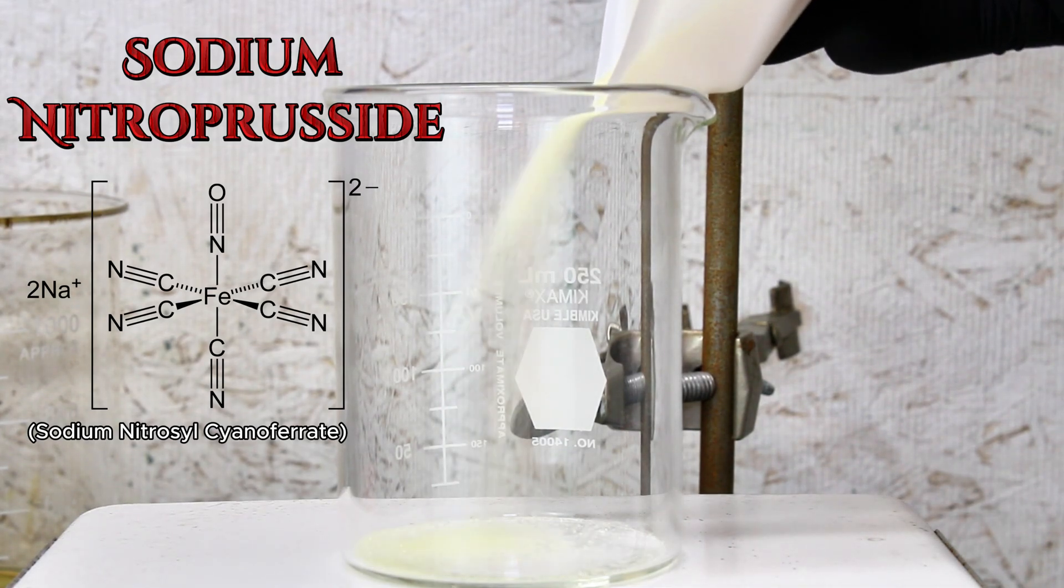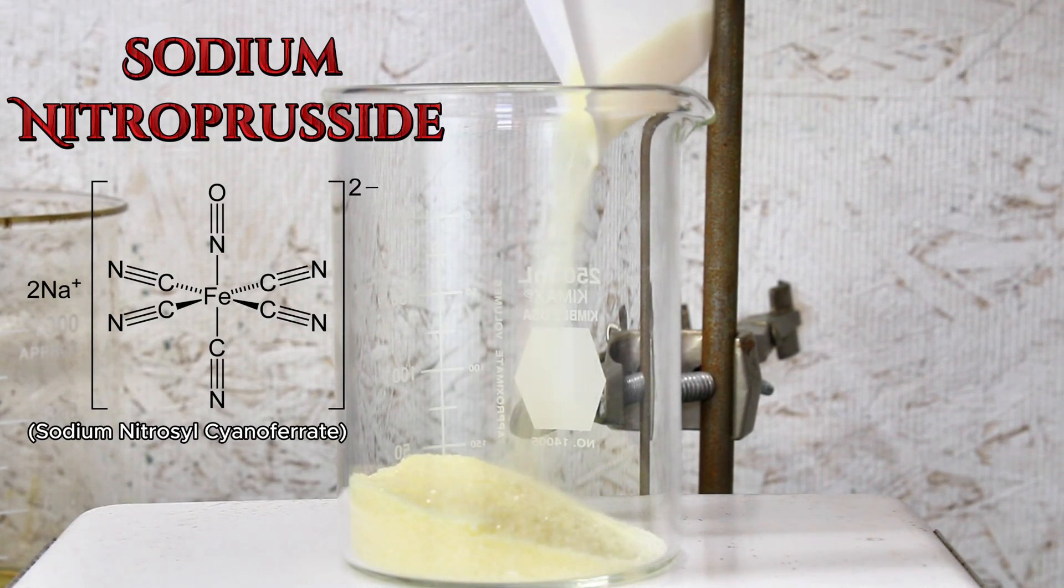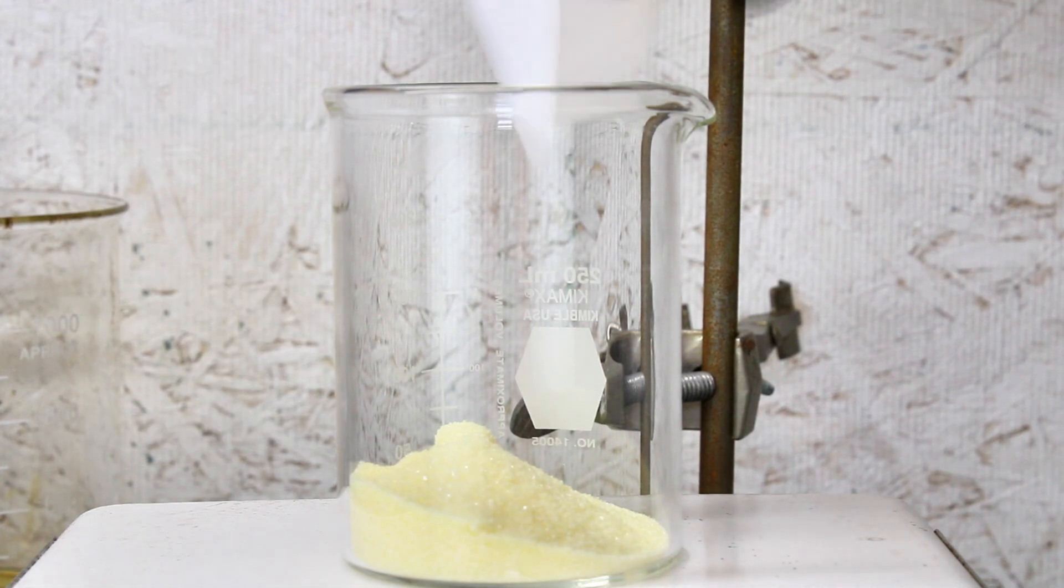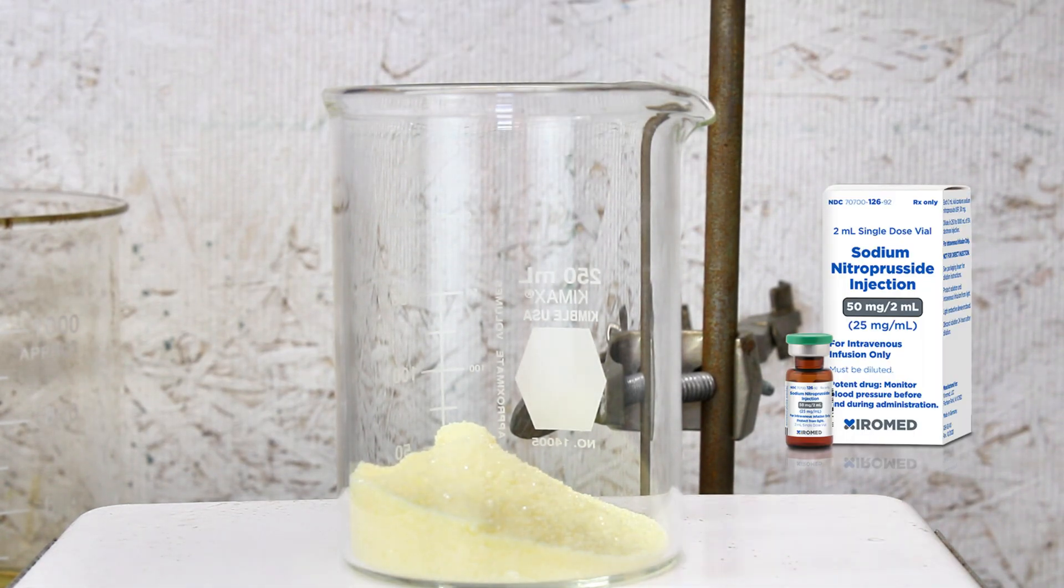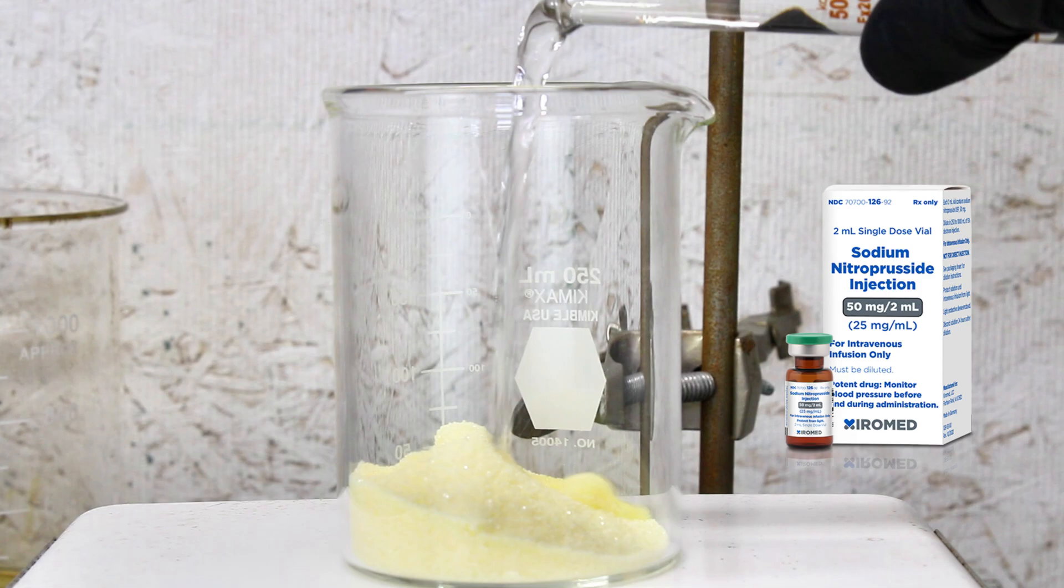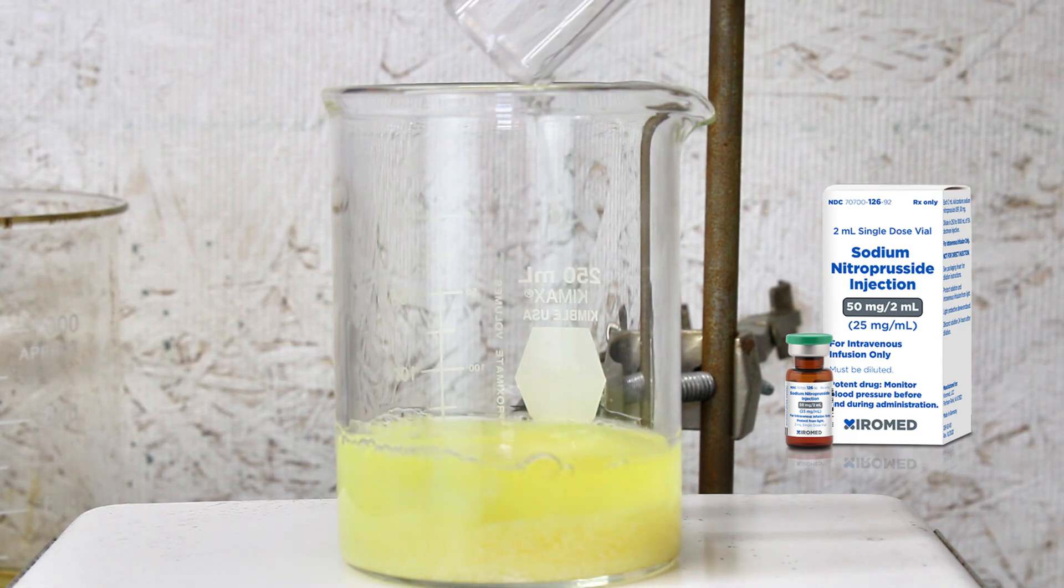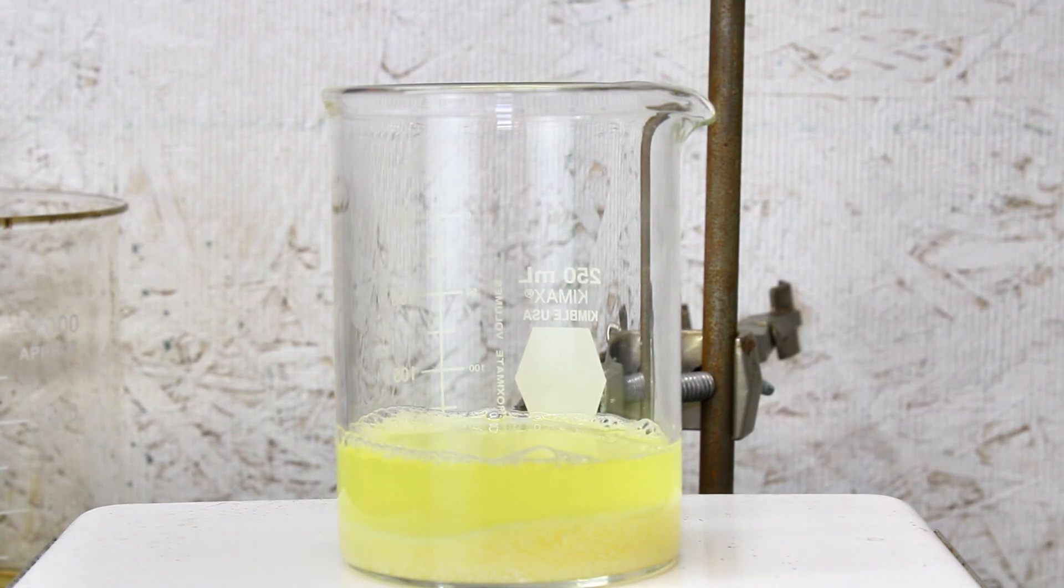Today I'm going to make the chemical sodium nitroprusside, which is primarily used as a medication under the brand name NitroPress. Sodium nitroprusside works by rapidly lowering blood pressure in the case of a hypertensive crisis or during surgery to reduce bleeding.